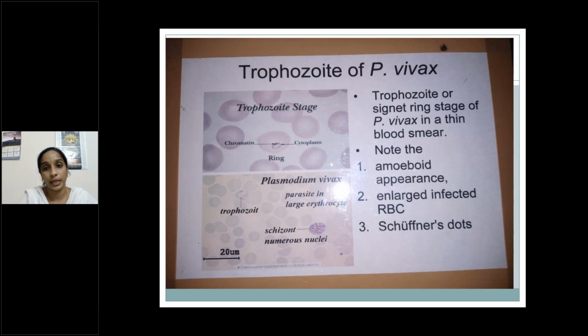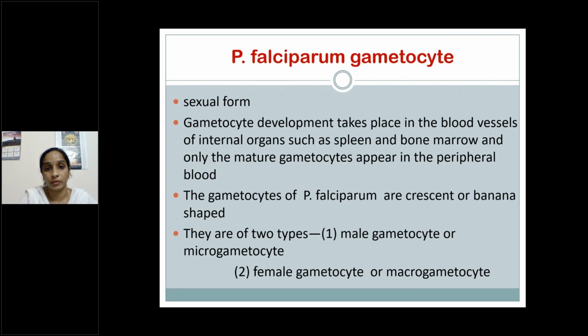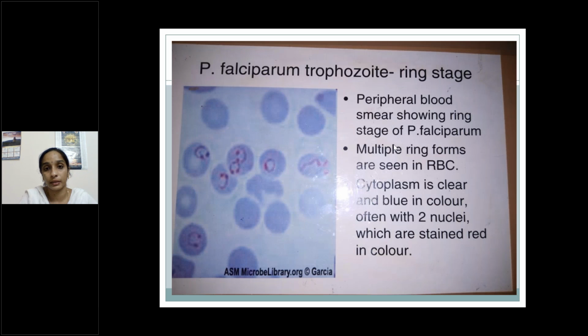Next, spotter number two, ring stage of Plasmodium falciparum. Note down the points.